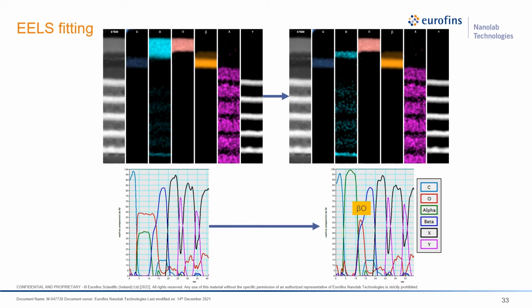So this means that the oxygen would exist before the deposition of alpha. So even beta carbide alone might not work. And actually, there is an oxide here at the beta surface, the beta oxide. So it shows that even this beta carbide alone is not a good candidate for protection against oxidation. And we have used EELS to exclude the effect of alpha.